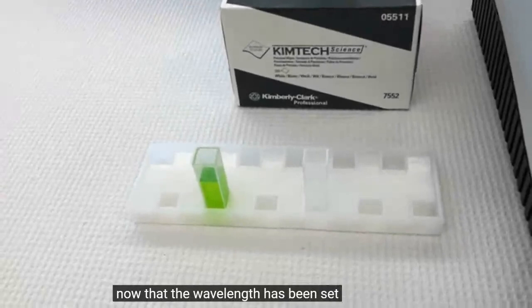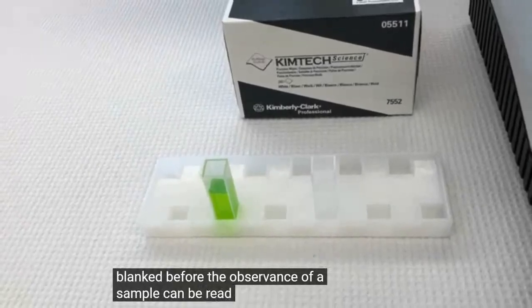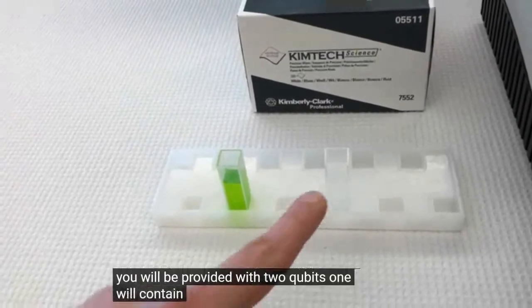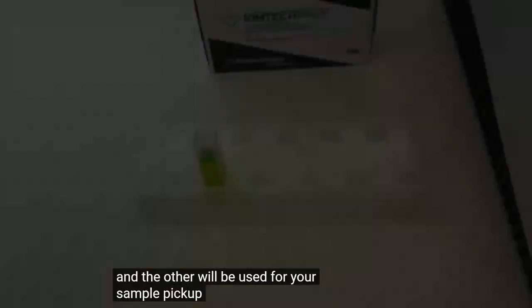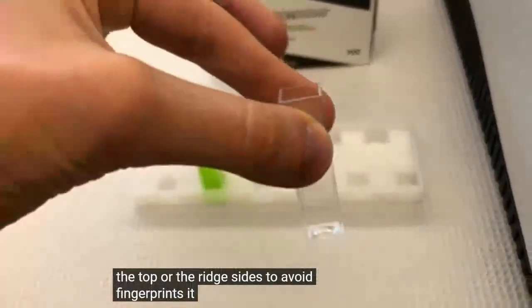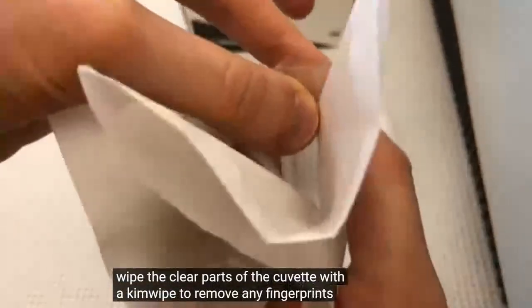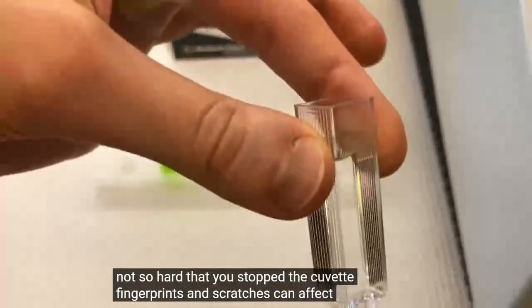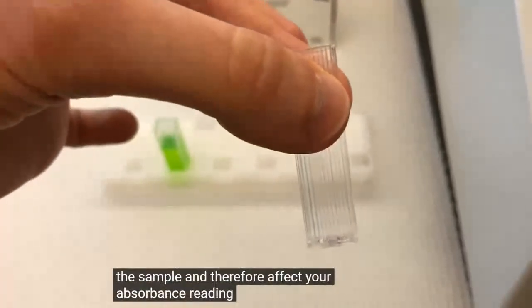Now that the wavelength has been set to 430 nanometers, the machine must be blanked before the absorbance of a sample can be read. For your experiment, you will be provided with two cuvettes. One will contain the blank or sample solvent, and the other will be used for your sample. Pick up the cuvette, touching only the top or the ridged sides to avoid fingerprints. It is important to gently wipe the clear parts of the cuvette with a Kim wipe to remove any fingerprints, but not so hard that you scratch the cuvette. Fingerprints and scratches can affect the passage of the light beam through the sample and therefore affect your absorbance reading.